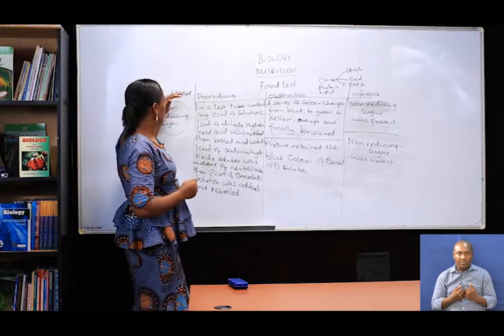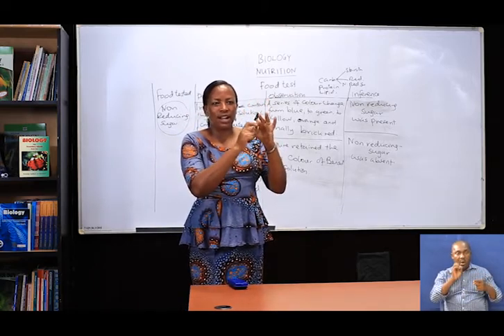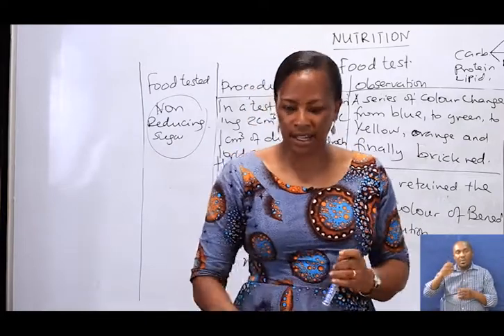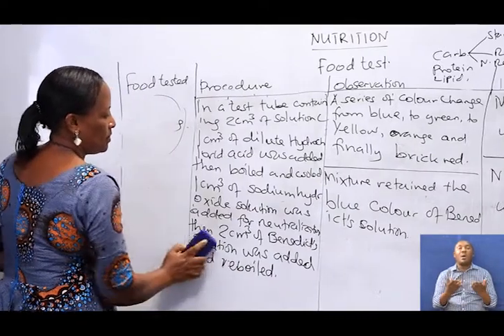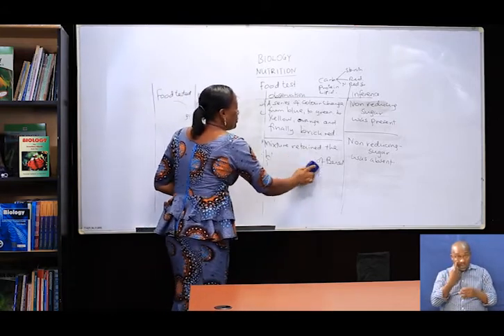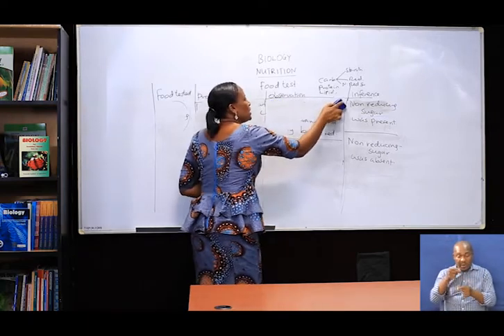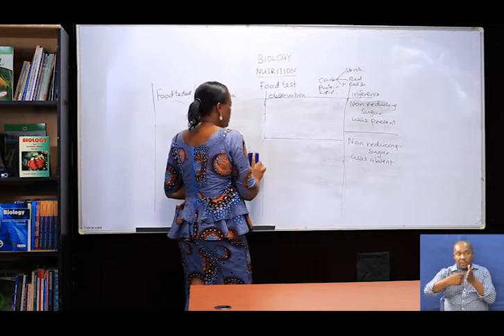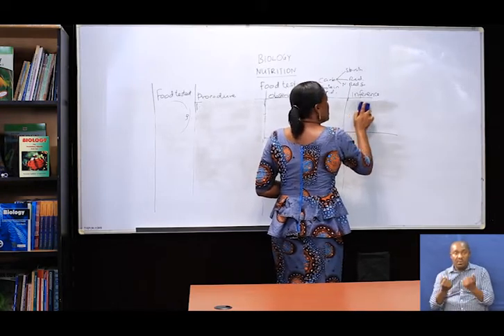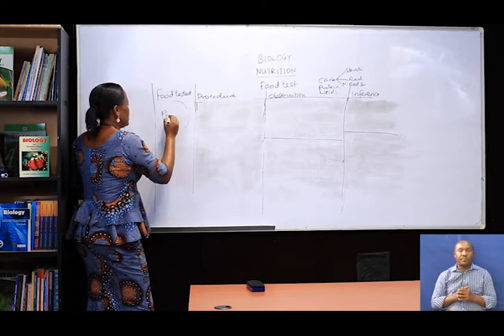This is the test of carbohydrate under its 3 states: the starch, reducing sugar, and non-reducing sugar. Another test is the test of protein. During the protein test, the points to be observed remain the same. Specify the apparatus, mention the food sample, specify the volume used, make sure that you observe the correct procedure, and don't use commanding language during report writing. Here is the test of protein.